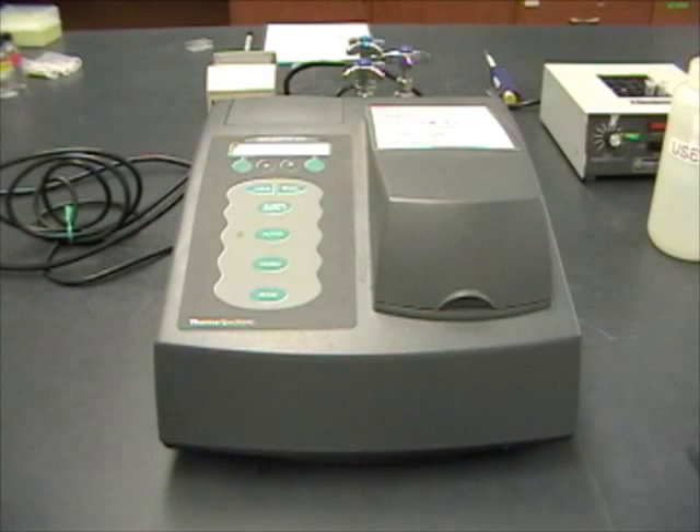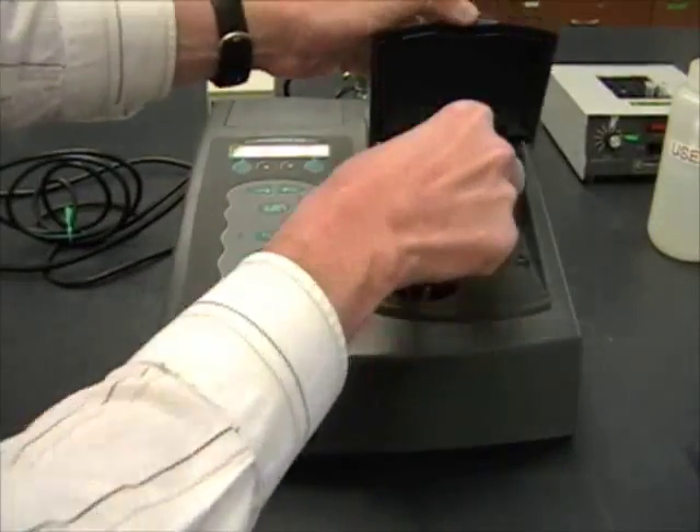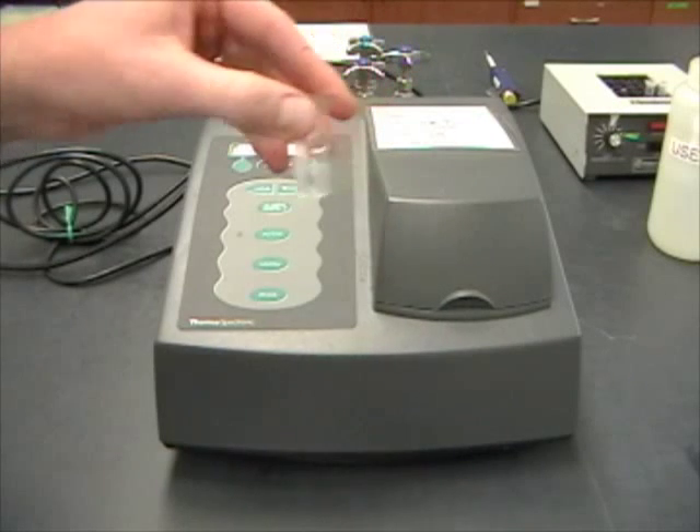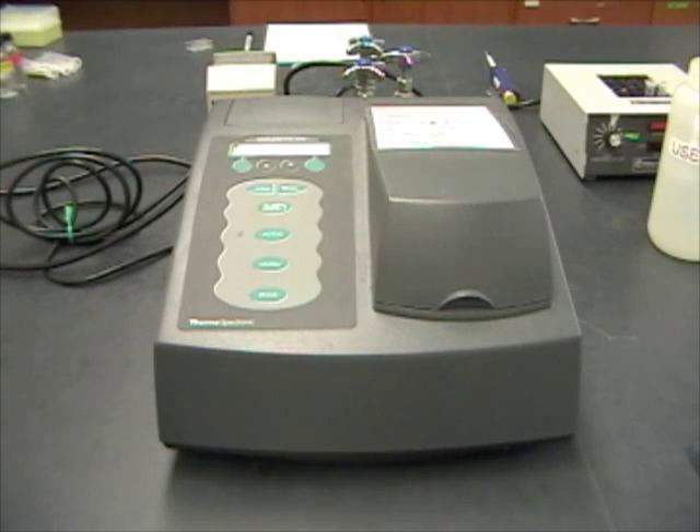Over the time that you're doing the experiment, the bacteria are going to keep multiplying. So it's important to calculate how many bacteria are in there to get an accurate measurement of the enzyme activity.